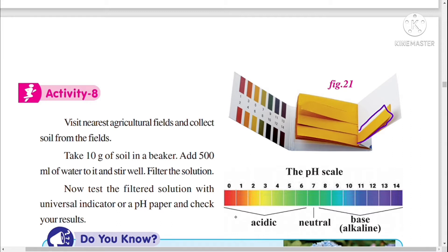For example, if we keep this strip in hydrochloric acid, it will turn into red color. The red color value is 1, so the pH of hydrochloric acid is 1. If we keep this strip in a sugar solution, the strip will turn into green color. Green color indicates pH 7, which is a neutral solution.